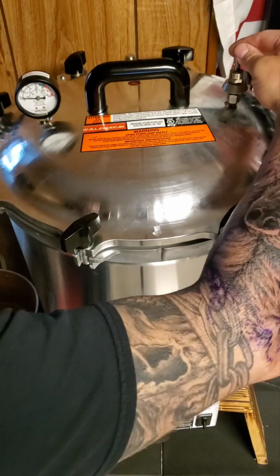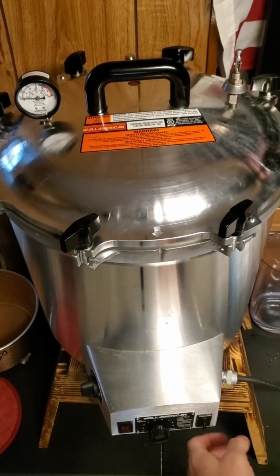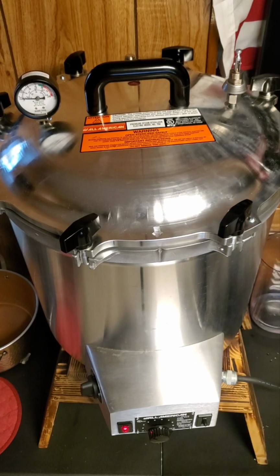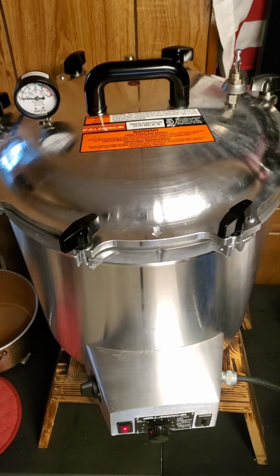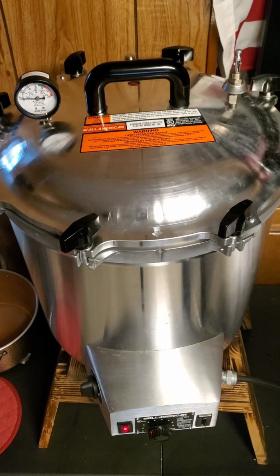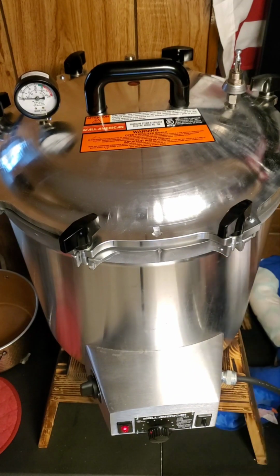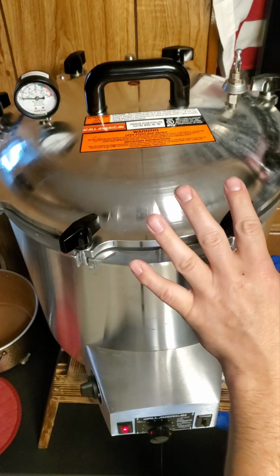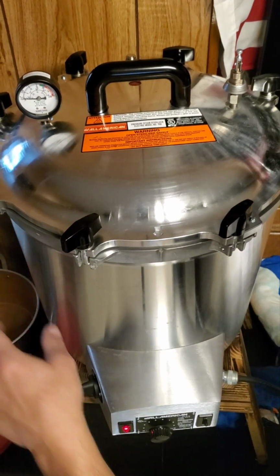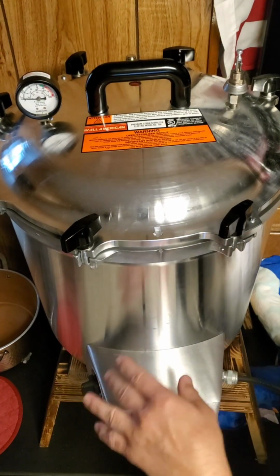All right, we got this in the open position right now. And turn it on. Turn it all the way to 10 until steam starts coming out of there. Moved the scale, plugged it in over there. We got our handy dandy towel on standby right here in case it starts spitting. It should be pretty good though. Shouldn't be a lot of water coming out of there since you don't fill it all the way up to the line. If you have problems with water coming out of the side, it's because it's filled to that line. Now that's what the factory recommends. You stick with doing your thing.